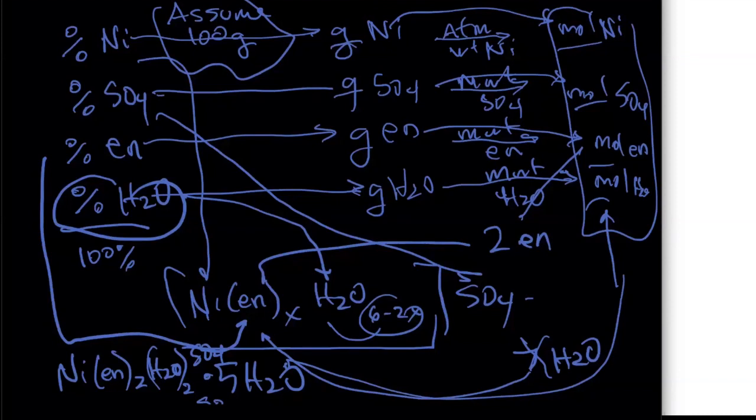Professor? Yes. Quick question. The 7 is the amount of H2O you calculated, and you have to allocate it to the part of the complex? That's exactly right. The 7, 2 would go to the complex, and then 5 would be the hydrated. That's the part that's sticking to the salt. Okay, thank you. Very good point.